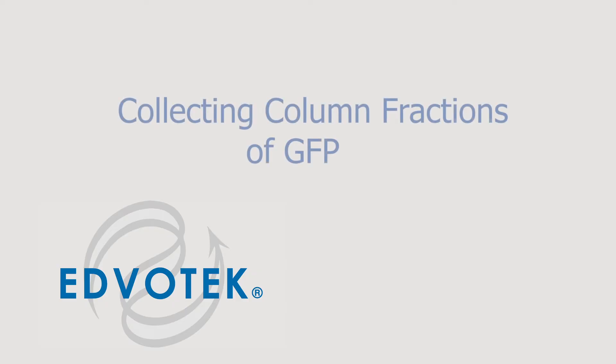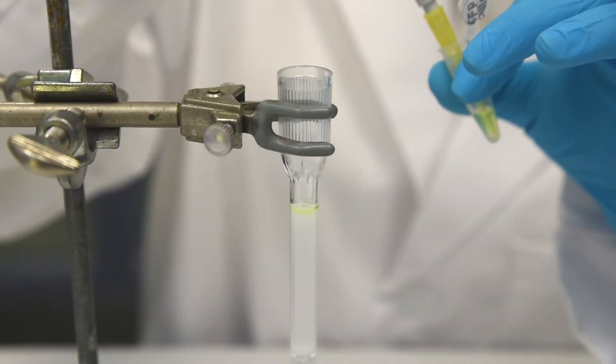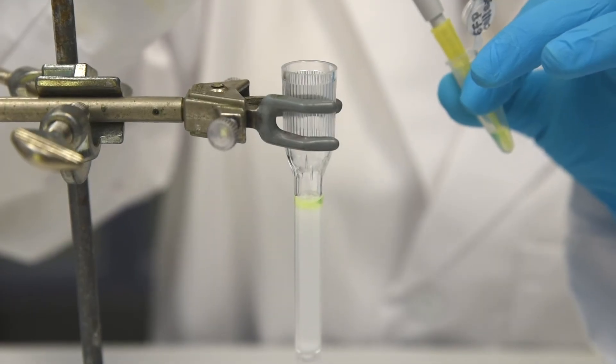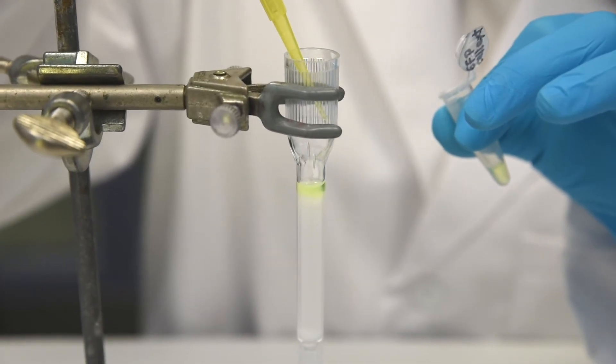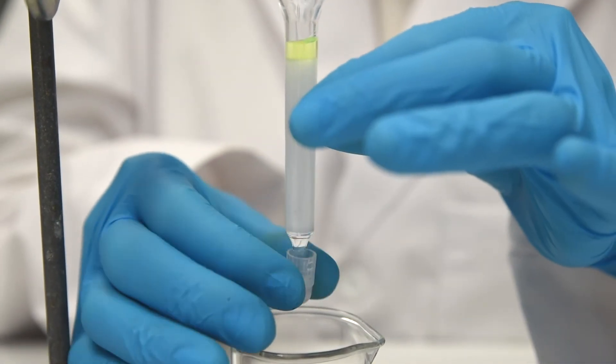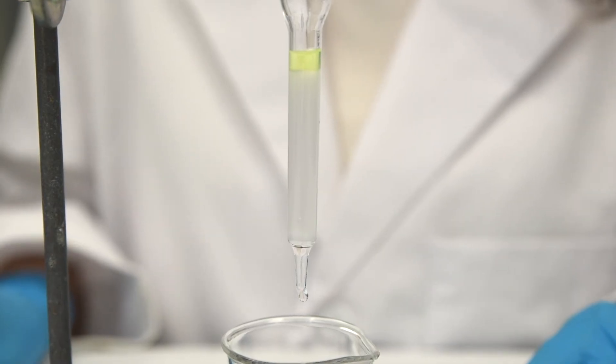Collecting column fractions of GFP. Step 1: Slowly load the column with 0.2 ml of the GFP extract from Module 2 or Control GFP extract. Remove the cap and allow the extract to completely enter the column, collecting the flow-through waste in your beaker.